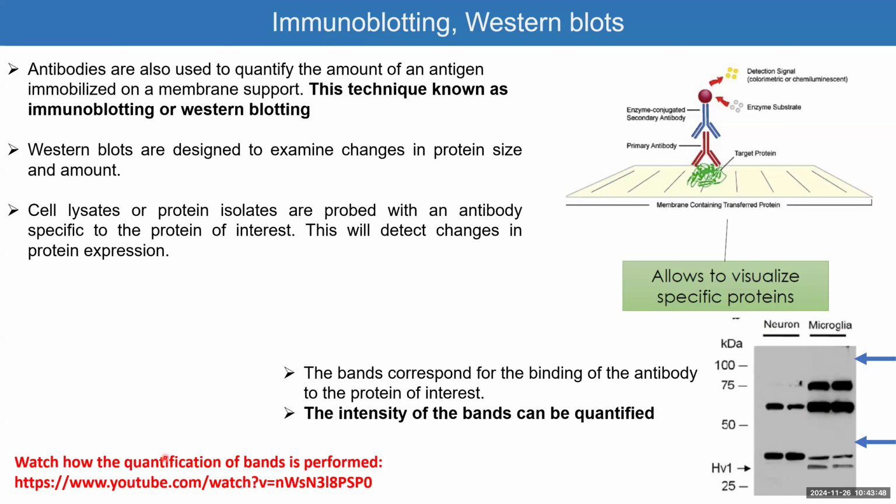I put a video for you here. One day, if you go to a lab and you're doing a Western blot and you've already got to this stage, you watch that video and it's very easy. You will create a region of interest around those in a program, and it will tell you the intensity in each of these, and it will directly give you a correlation of the concentration of the protein. Obviously, there is more of this protein expressed compared to that in these different cell types.